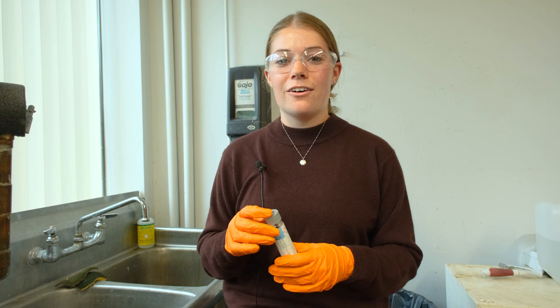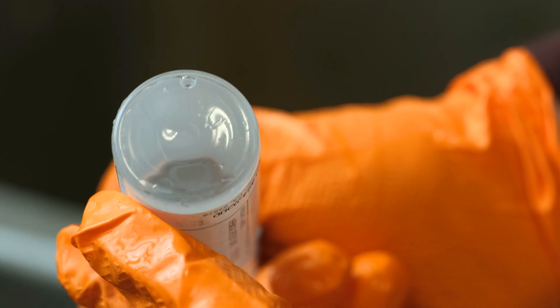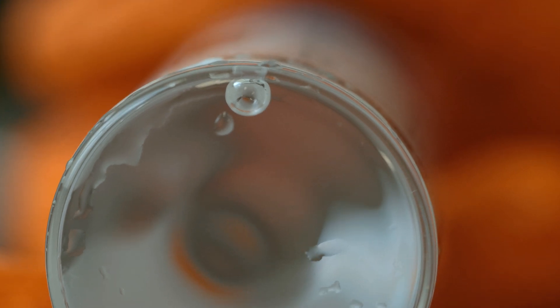If you do end up with a bubble in the vial, the constituents could volatilize into the airspace, and you'll end up with an inaccurate reading from the lab.